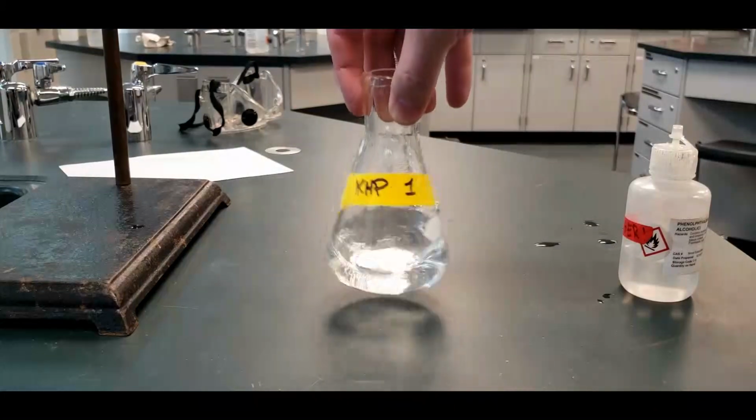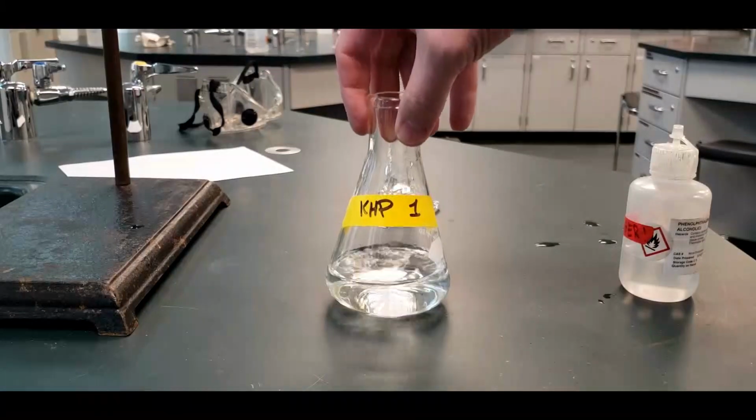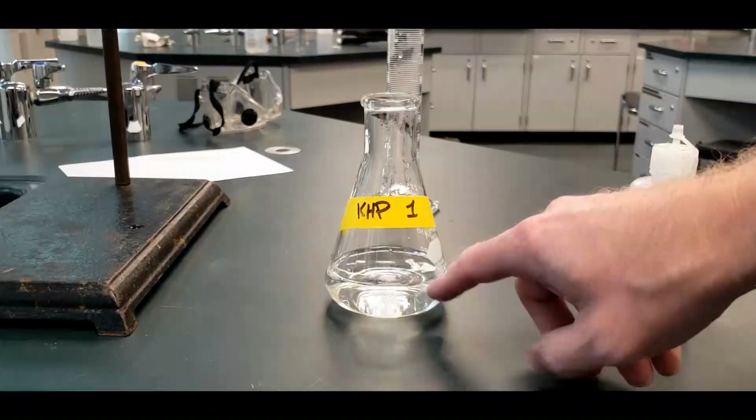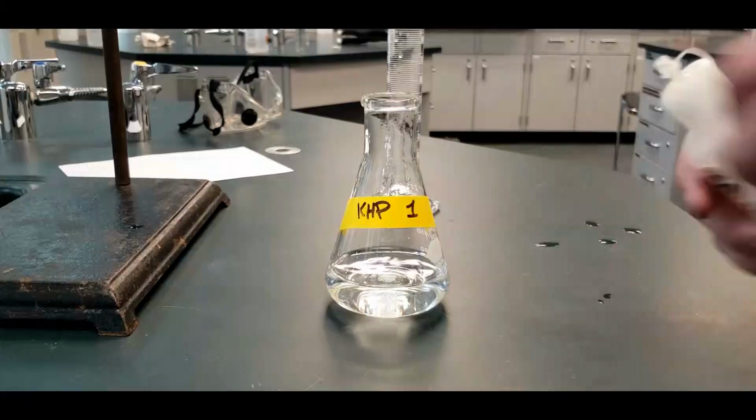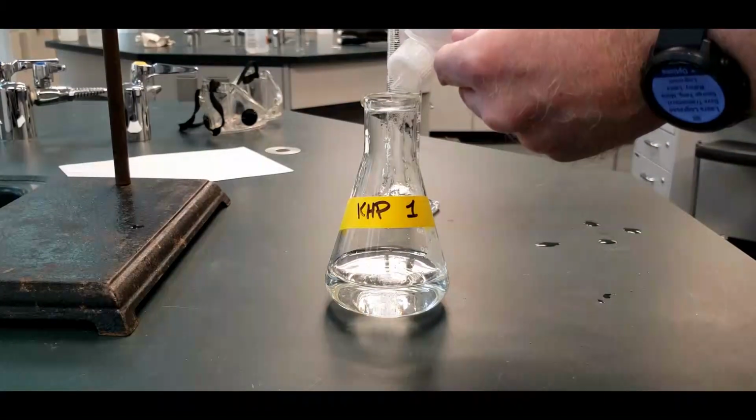So when you reach the end point, it's nice, and you have the color change, then it'll just disappear because it's still working on the KHP that's dissolving. So it can be kind of frustrating. So we want all of this to go in. I'm just going to put in the indicator.